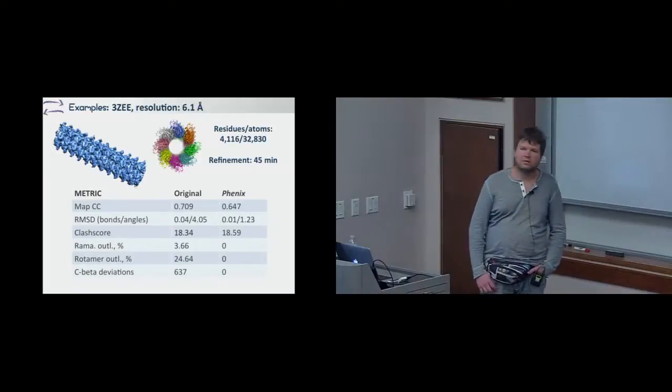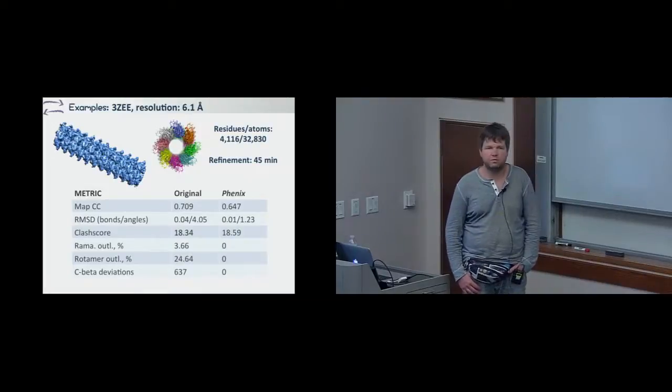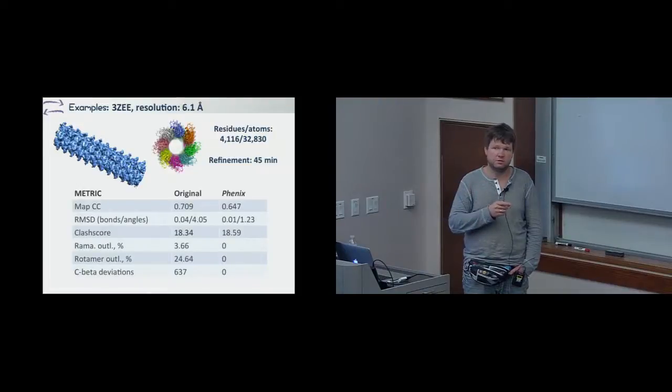Well, it's a very good question. There is no R-free, but basically you need to choose. Here we have a binary choice. You have a marginally larger map correlation and a hugely distorted, chemically distorted structure. That's your first choice. And the second choice, you can get rid of all chemical nonsense from your structure at the expense of slightly lower map-to-model correlation.